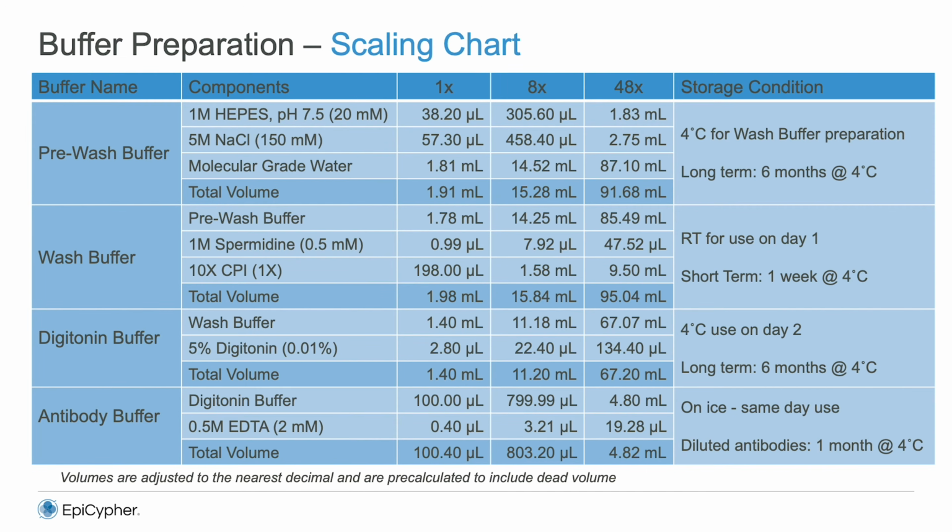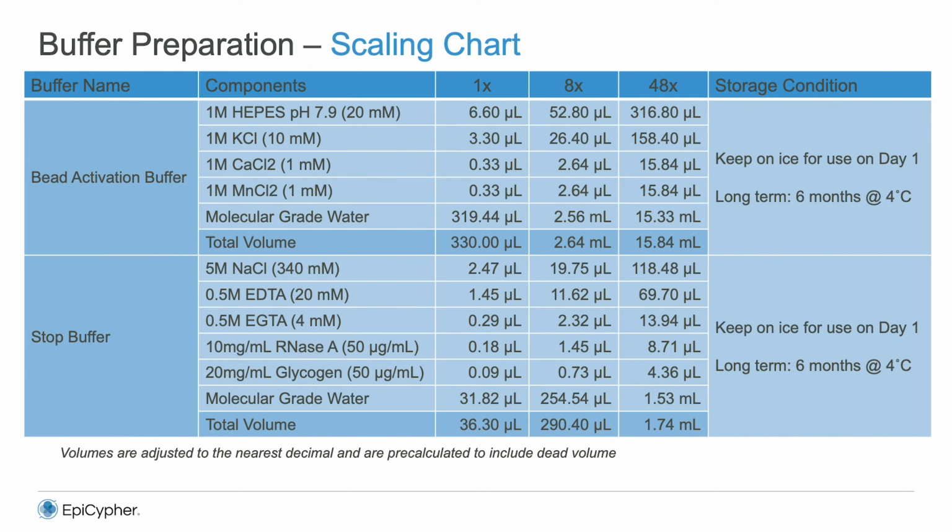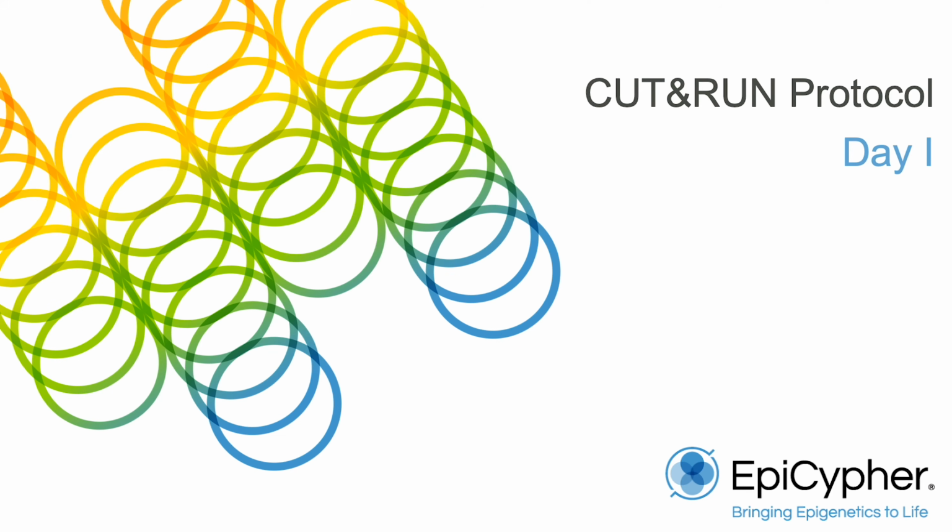We have also provided the scaled-up volumes for these buffers. We always recommend using final concentrations to validate your volumes. In addition, please keep in mind that these volumes are adjusted to the nearest decimal and are pre-calculated to include dead volume. We are now ready to begin the experiment.